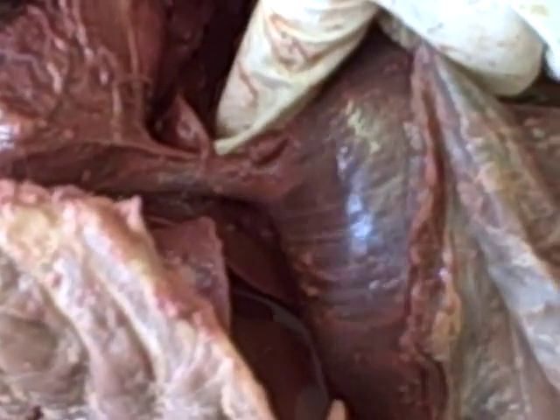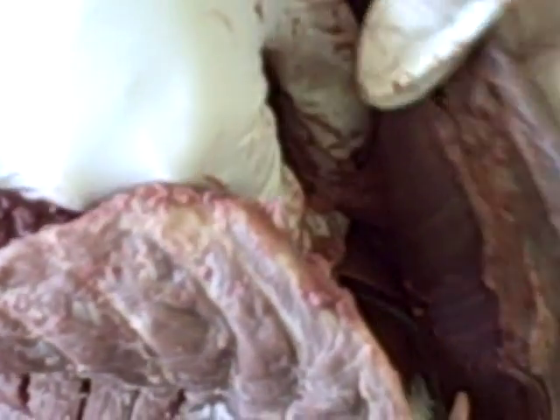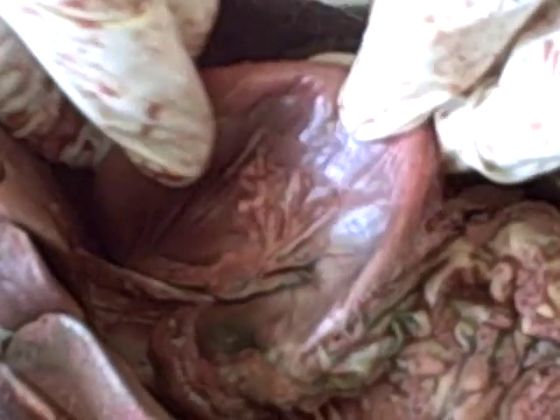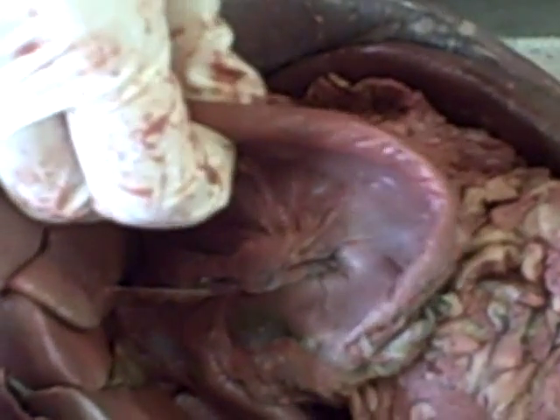You note that there's a tube, if I remove some of this tissue here, that runs from the mouth, passing back underneath this, all the way down and actually entering this large dome-shaped muscle right here, passing through underneath, and entering into this large organ here. So the next question would be, what is this large J-shaped organ that entered from this tube, ran underneath this large muscle, and comes underneath and enters here?